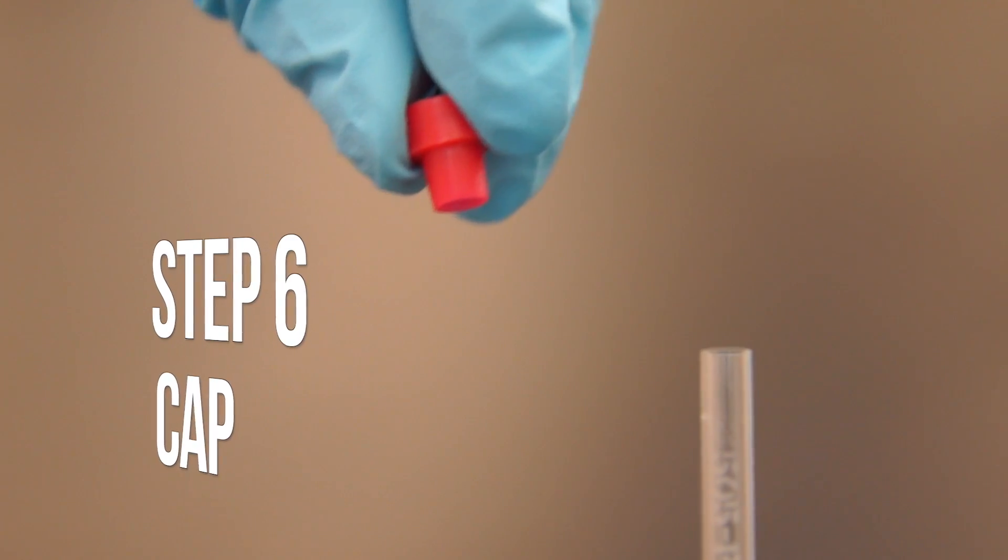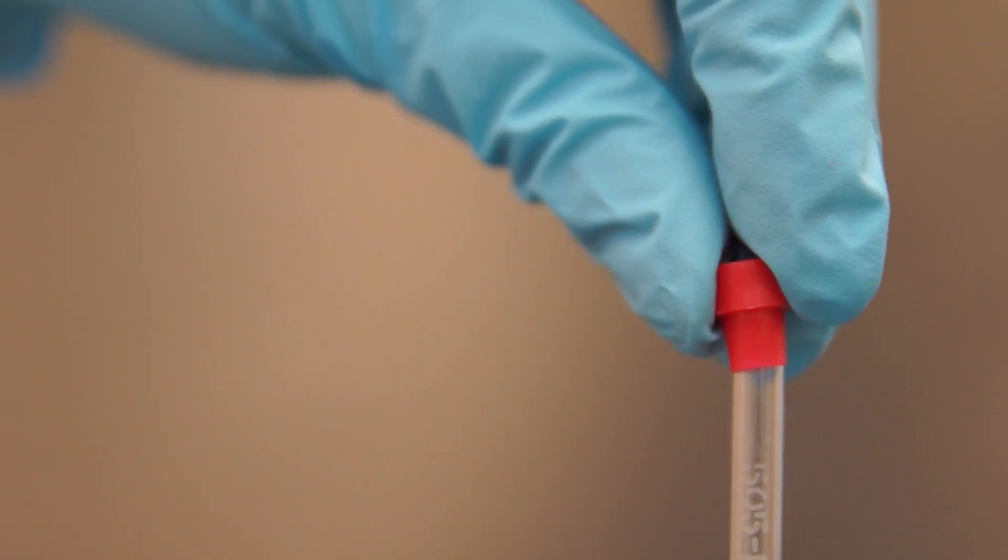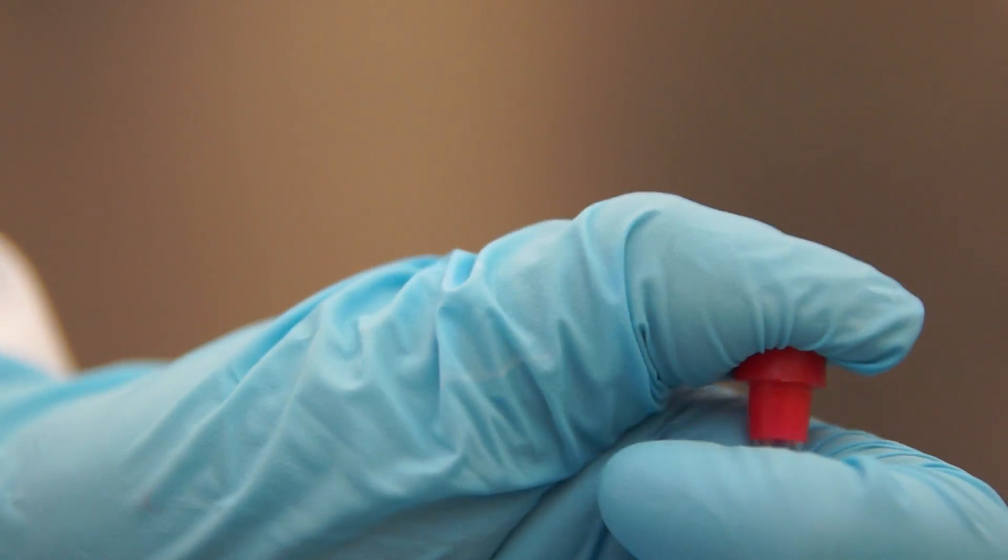Step six is to cap your sample. Make sure you put your cap on straight. If it's tilted a little bit, it will offset your sample reading in the NMR. Here's an example of a bad cap.